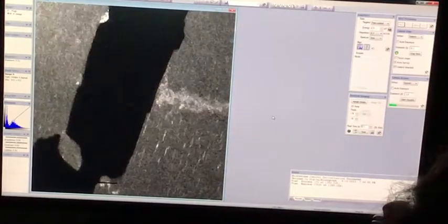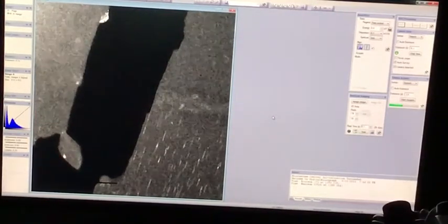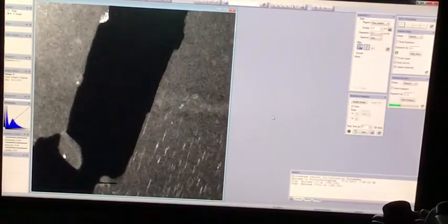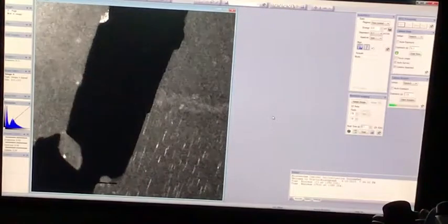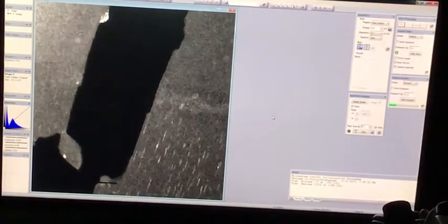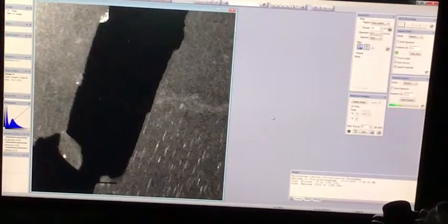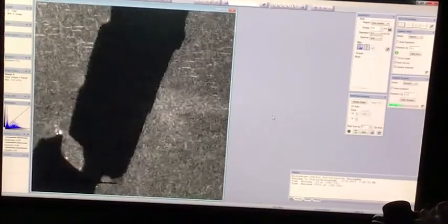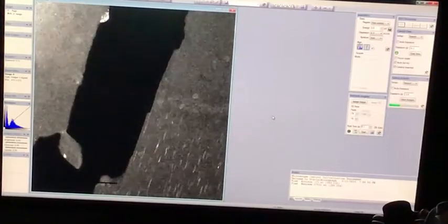Okay, so eventually I'll recover the bright field. Oh, look at those. See that? That's a dark field image of those objects. They're scattering differently to the parent material around it. So that tells us that we've got some nice plate-like precipitates in there. And of course, as I move the aperture, the contrast changes significantly. Oh, there they come back again. That's in one direction.